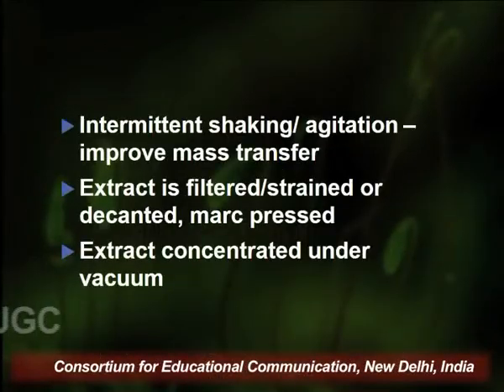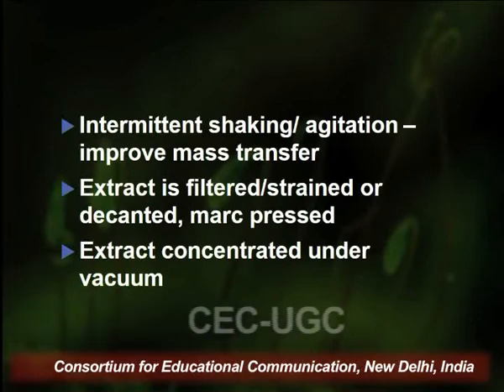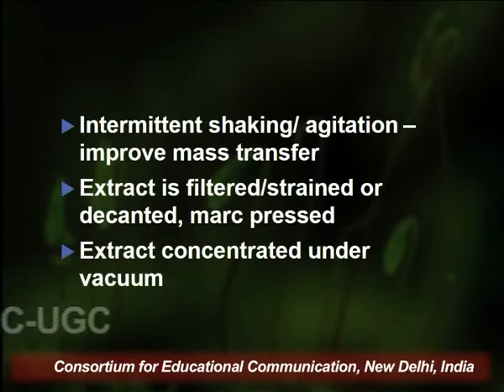Then this mixture is allowed to stand for a specified period of time, which is generally 7 days, but minimum it should stand for 3 days. Once the specified period is over, we filter the extract, or we strain or decant the solvent from that mixture, and the marc, which is the material left behind, is pressed. The pressing is further mixed with the filtered extract.